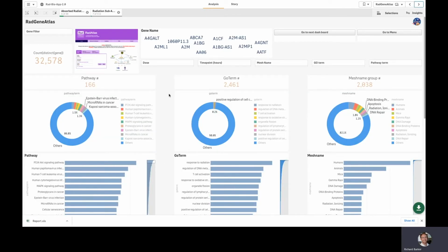Now, with the knowledge of which studies in the GeneLab repository have radiation values that are comparable to previously measured spaceflight values from robots in orbit and beyond, we can now start to look at those studies and try and look for genetic patterns. So this is just a brief example because there's a lot of studies within the GeneLab repository, so we can only scratch the surface in this particular app.